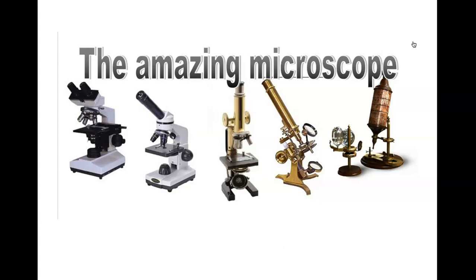Microscopes have changed. Currently, the microscope that we are going to use is this microscope right here. It is a monocular, meaning one ocular lens, microscope. They are compound light microscopes, meaning that they are using multiple lenses, two lenses, hence the term compound, and we are going to focus light in order to magnify.